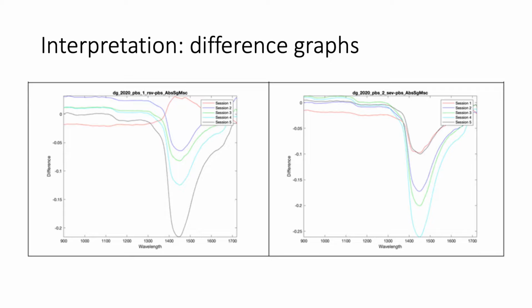One highlight is the bottom right value, 0.9, which means using this combination of pre-processing, SEV sensitivity can be as high as 90%, which is quite decent using this approach. The last two columns also suggest that SEV is more sensitive than RSV using this approach.